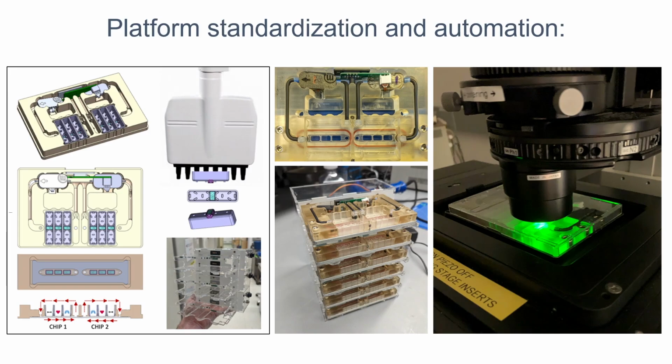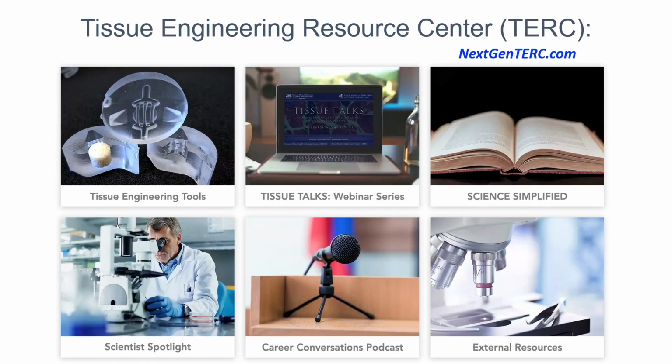This stack of 6 platforms that you see here actually came from a robotic device that is manipulating these platforms, placing them into imaging devices, liquid handlers, etc. So this kind of hardware is now getting ready. We already started to share with some of the collaborating labs, but we are planning to share it much more broadly. And now, in closing, just 2 things to say.